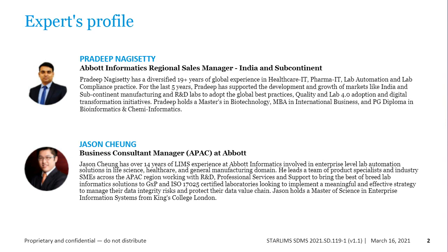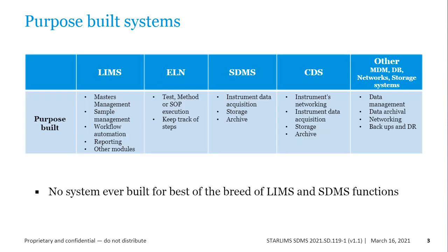So I'm here to share my global and regional experiences, having worked in labs for 10 plus years, and now being on the other side, offering lab automation solutions from Abbott Informatics, STARLIMS. I trust this is the best of the two worlds anyone can experience in this space, and to give it back to the scientific community. With that, I'd like to jump into a quick recap of various lab automation solutions and what purpose they were built for.